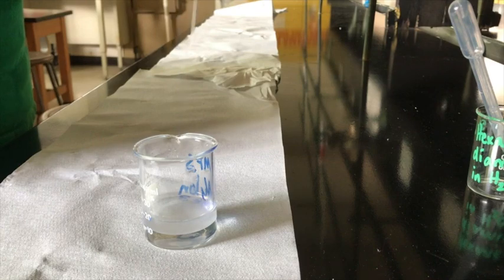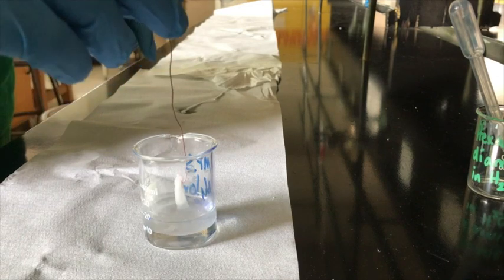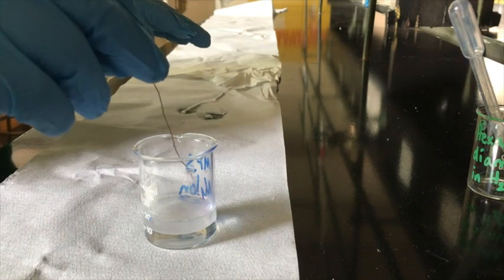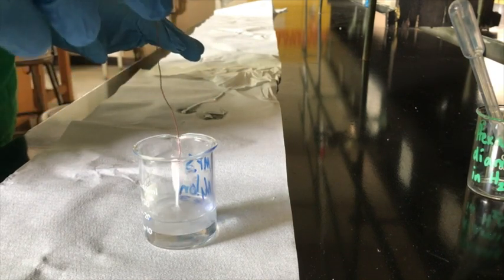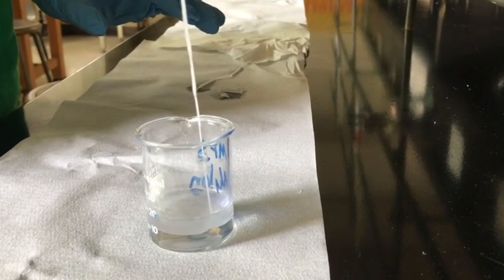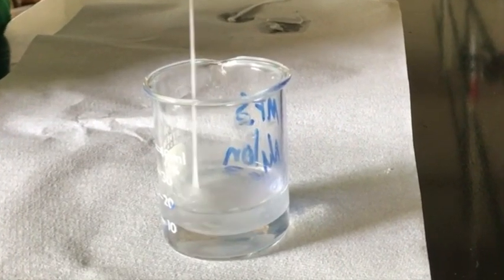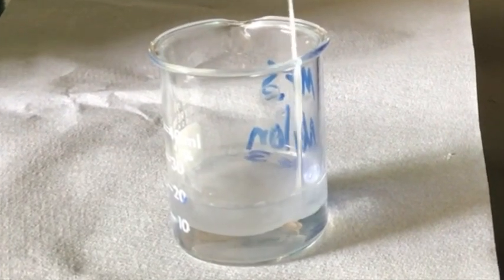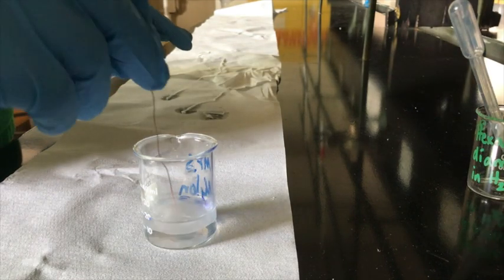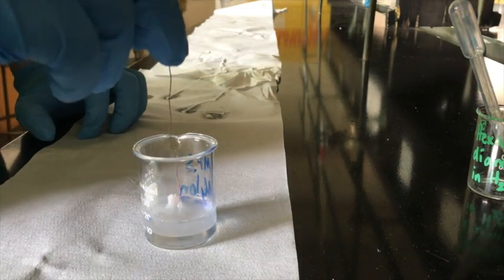Fighting me a little bit. Oh, you know what? Maybe it's not just me. Maybe it's just our solutions today. Maybe these are older. I don't know. Yeah, it's not working out very good today. Still getting some nylon though, but you can usually get a longer strand of it. Here we go. Come on, come on, come on. Ugh, hit the side. Ugh. Yeah, I thought maybe having it basic would make it a lot better, but.